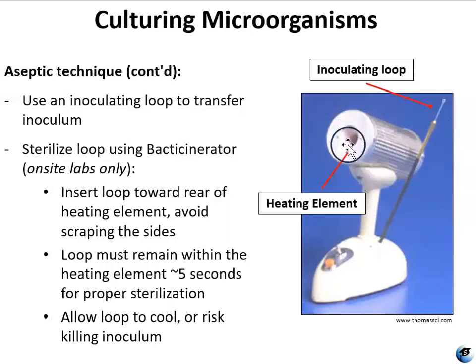And then once you take it out of the heating element, you want to allow it to cool, and you would not want to cool it by blowing on it. You don't want to set it on the counter because then it wouldn't be sterile anymore. So the easiest way to cool a sterile loop would be to use sterile media, touch it to sterile agar, and if it sizzles, then it's not ready. If it's still sizzling, it's too hot. But you do want to cool it, because if you cool the loop, then that prevents it from killing the bacteria that you're trying to grow.